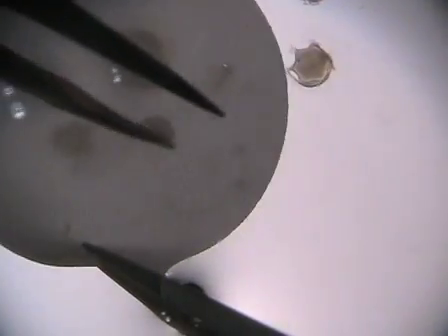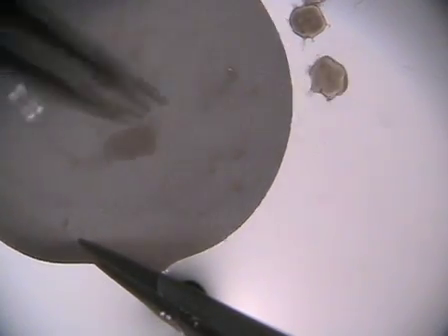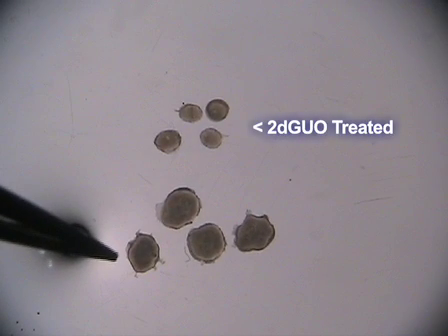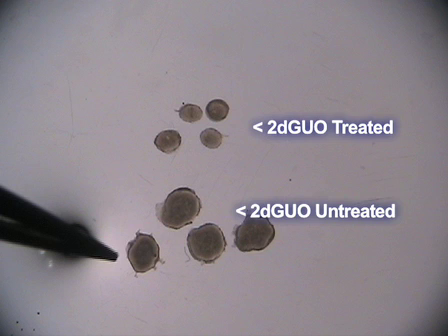After a period of culture, typically 5-7 days, FTOCs are harvested by submerging filters in media and pushing the lobes off gently with forceps. You can see that a-lymphoid FTOCs are typically smaller and cystic compared to non-deoxyguanosine-treated lymphoid lobes.